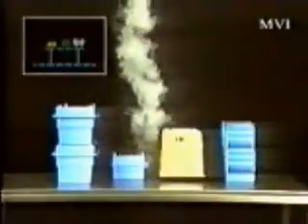Work surfaces that are well perforated will reduce the risk of workplace turbulence, and all work surfaces should be separated from themselves and remote from vertical surfaces by at least 10 centimeters. The arrangement of equipment and materials on a work surface should be such that turbulence is reduced to the minimum, and that cascading of air from item to item should be eliminated wherever possible.